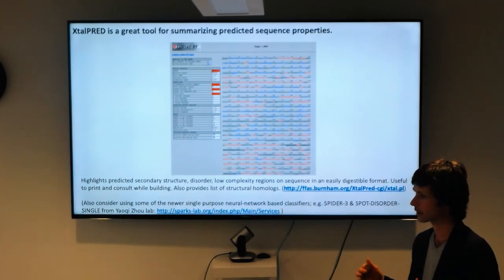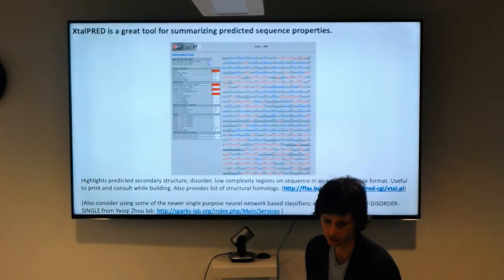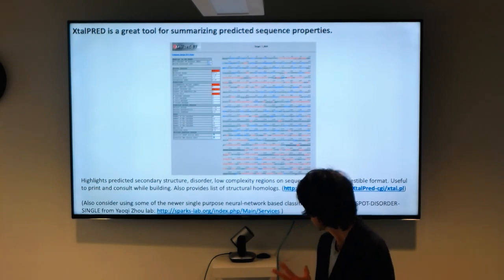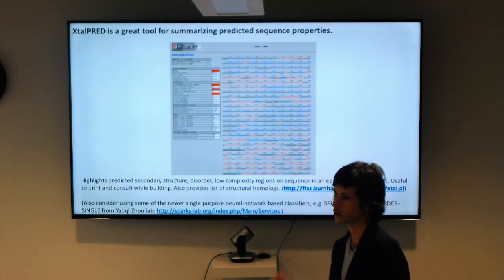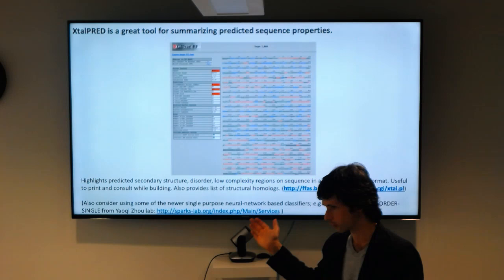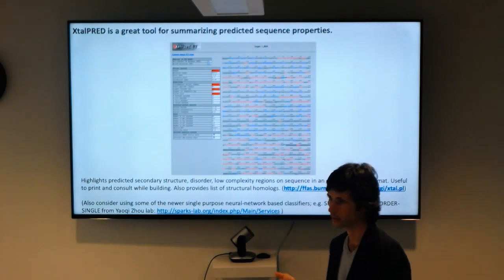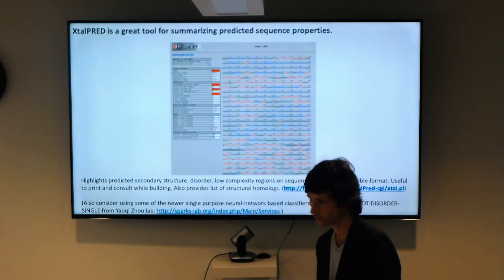And you want to have pretty strong evidence if it's conflicting on a broad scale with secondary structural prediction. Disorder is not quite as strong. Some regions that are predicted disordered will actually be ordered, but it's still a good thing to pay attention to so that it can give you additional confidence. If you run out of density and you're also hitting a region that's predicted to be disordered in the sequence, that gives you extra confidence that you got it right, that you're okay so far anyway.